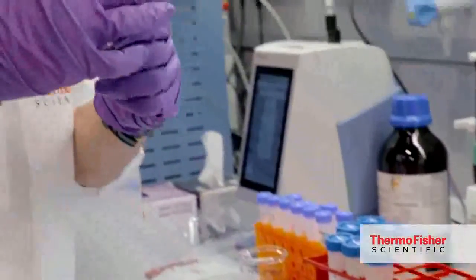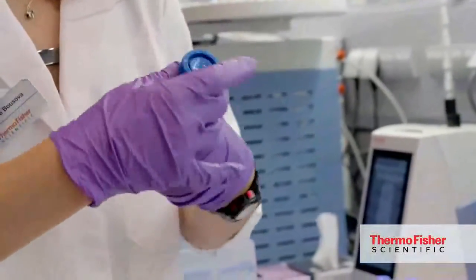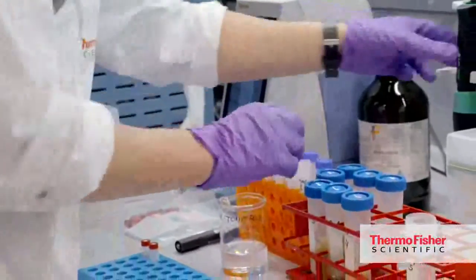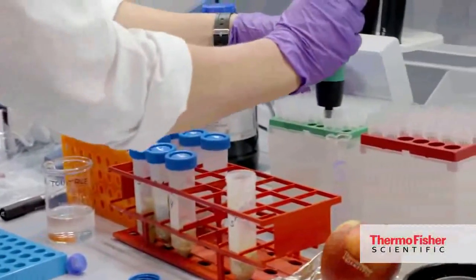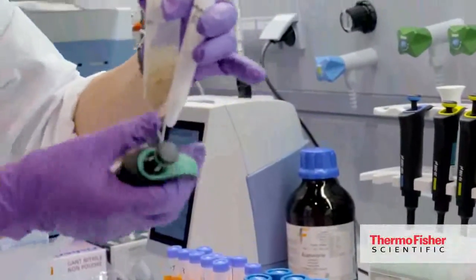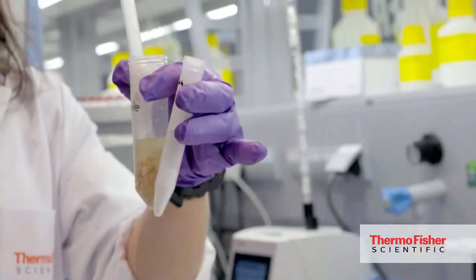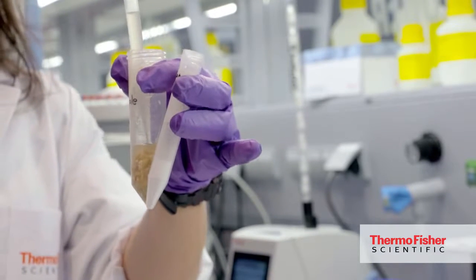And the whole tube will be shaken. So normally the samples are centrifuged. The centrifuge tubes are centrifuged so that the solid and the liquid parts can be separated. Whenever it is done, we just take the supernatant from the extraction tube and we transfer everything into the cleanup tube.